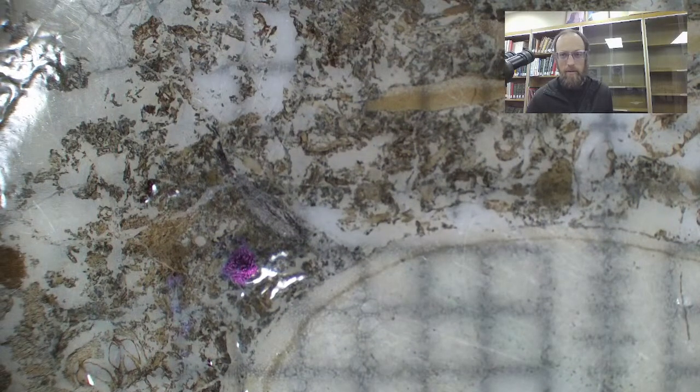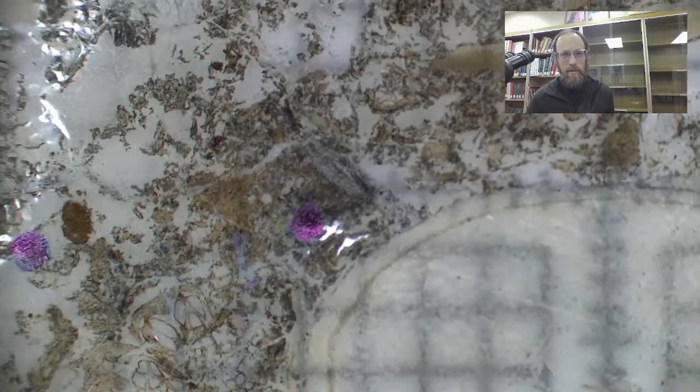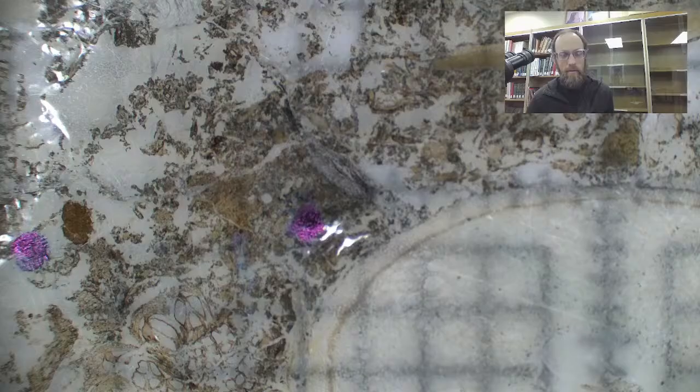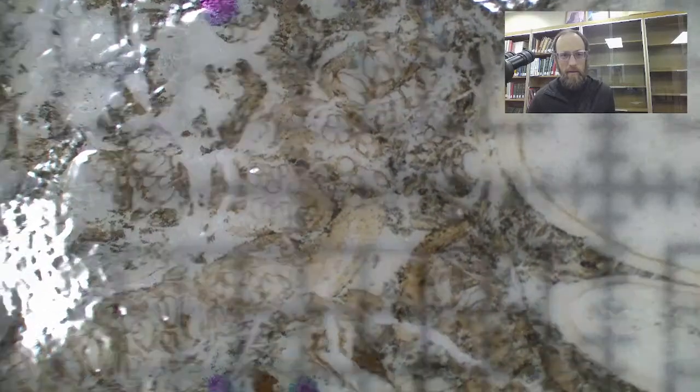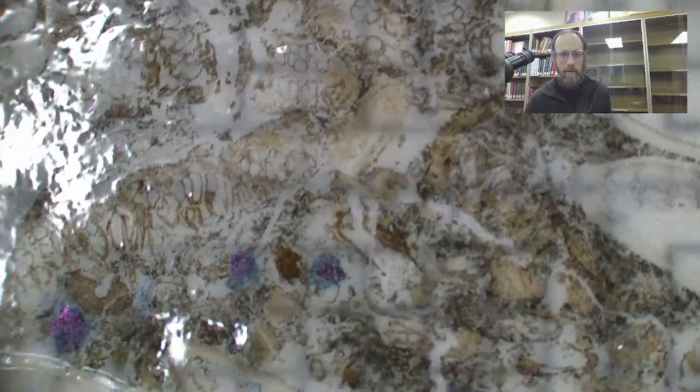How one of these is acquired is that one of these objects is cut, a surface is polished, and the surface is transferred onto an acetate peel.